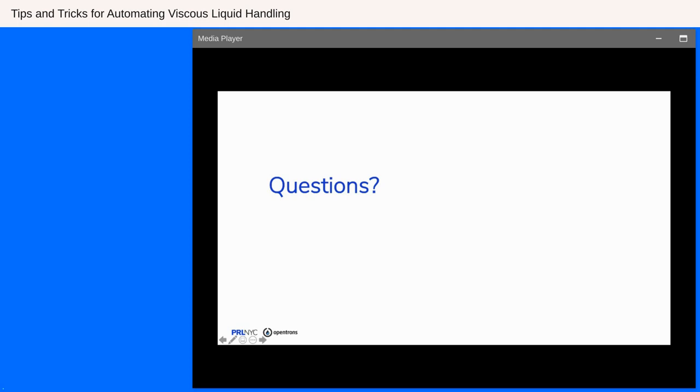Great, thank you. Our next question, could you comment on changing pipetting parameters as the temperature decreases and increases liquid viscosity?